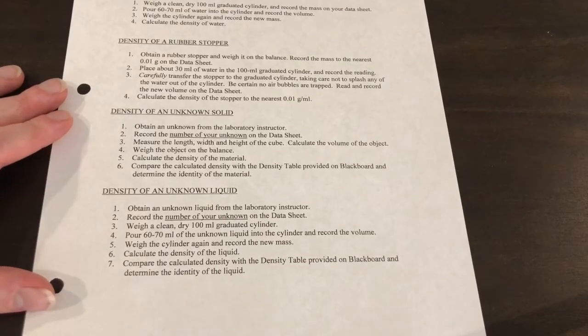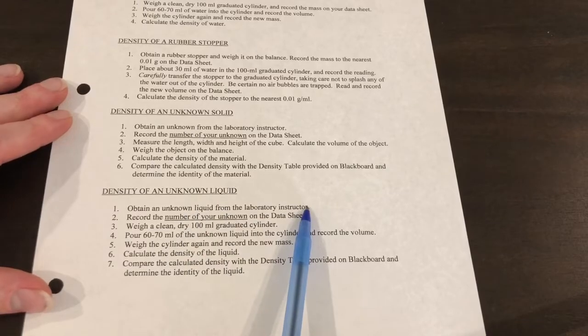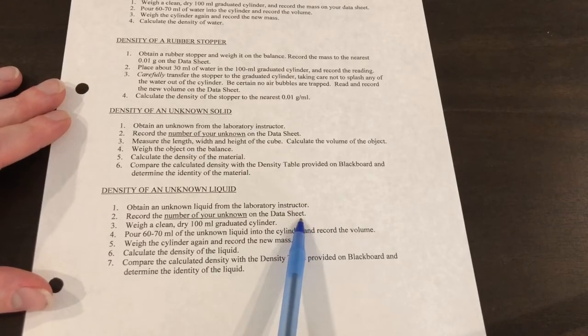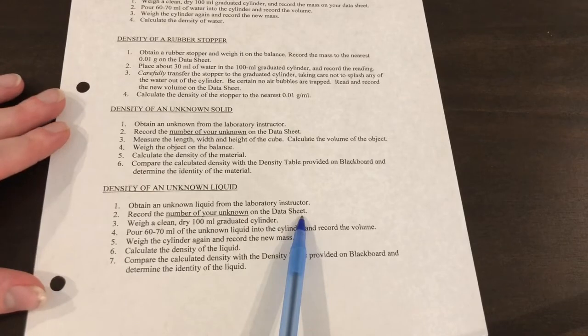We're going to obtain an unknown liquid from your lab instructor. I obtained, I believe, vinegar and isopropyl alcohol. So when we do these, we should have densities really close to those.